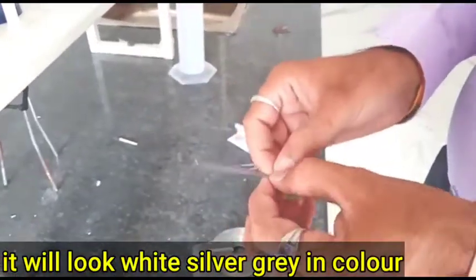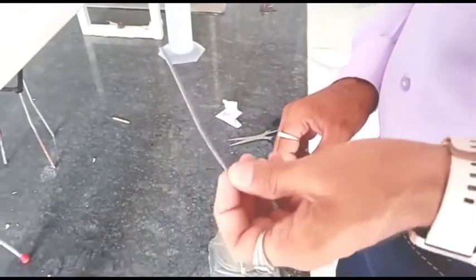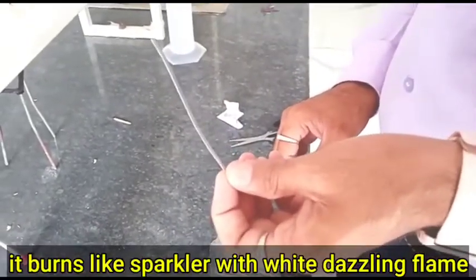Let's burn it. It burns a dazzling white flame like sparkles.